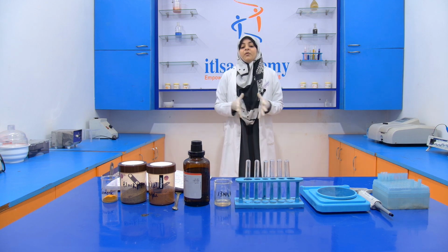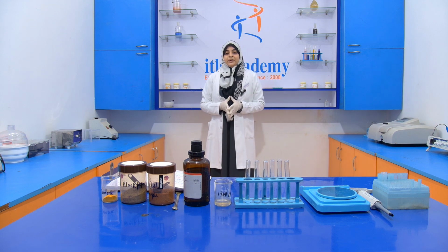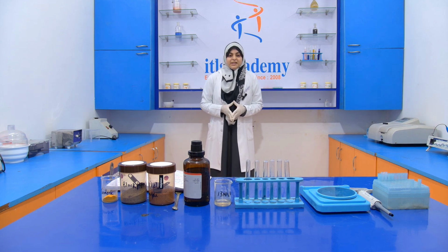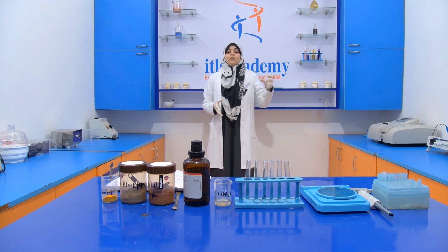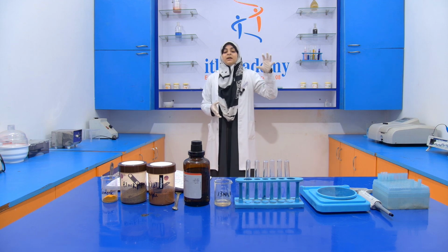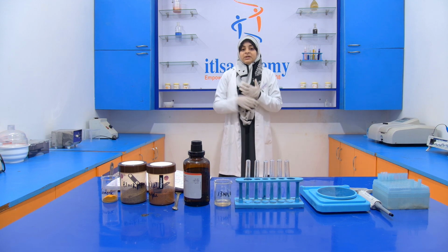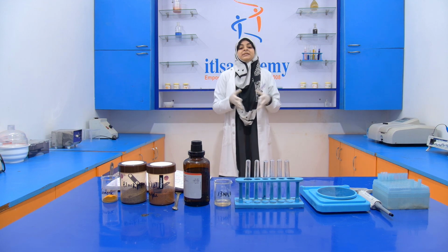Okay, so first of all we have to know what adulteration is, because when we are performing this experiment, we find that the coloring agent acts as an adulterant. So we have to know what the adulteration is and what the adulterant is.